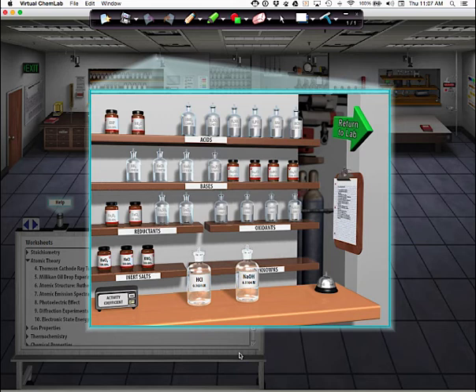So guys, it doesn't mention this in the lab, but you may want to write this down. Next to step 6, you need to write down, record the concentration. So we are now going to record the concentration of the standard. It is 0.1104 molar.